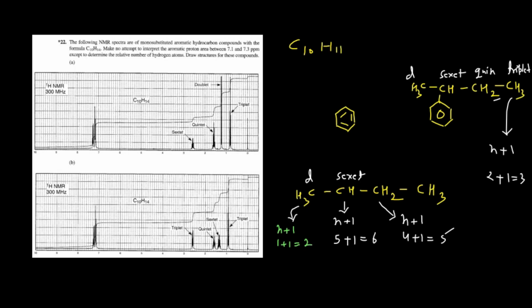And if you now see the different kinds of hydrogens present here, I already explained to you that in the monosubstituted benzene ring, this will produce a multiplet, M, resonating near about 7.1 ppm. So you have fixed this sextet, which is this one, and then the quintet, which is this one, and then a doublet, which is this one, and then again a triplet, which is this one.